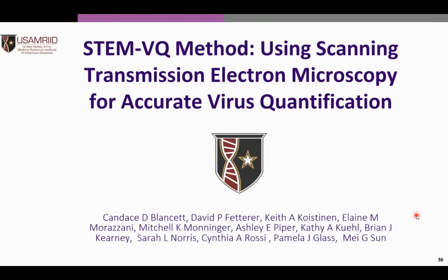So I'm going to talk about STEMVQ, which stands for Scanning Transmission Electron Microscopy. Virus quantification is what the VQ stands for. So we basically took an old virus quantification method done by EM and tried to make some updates to it to make it a lot more reliable.